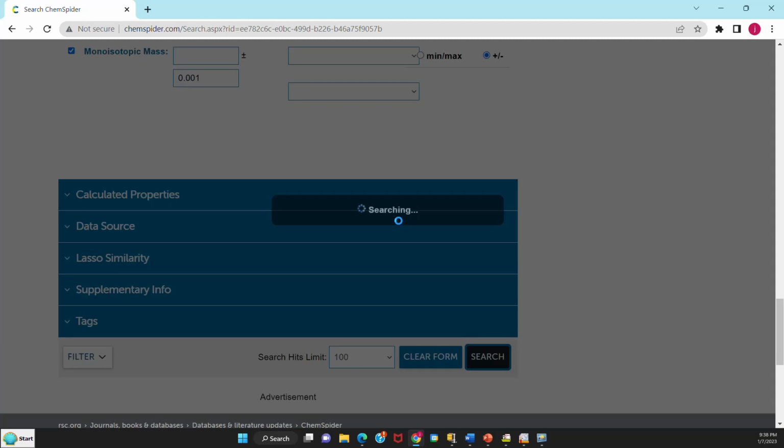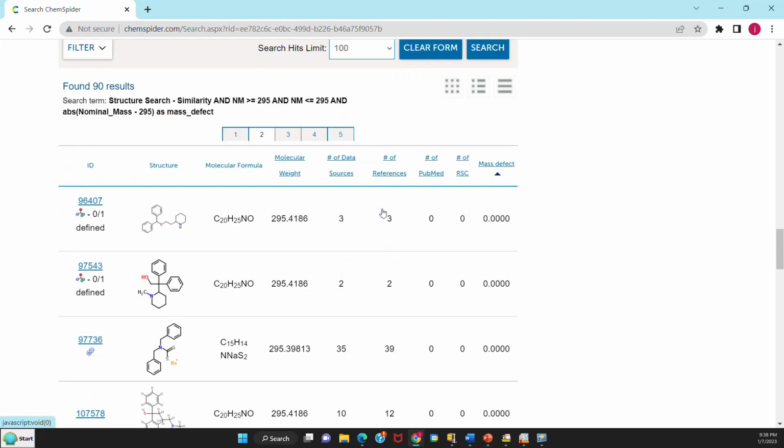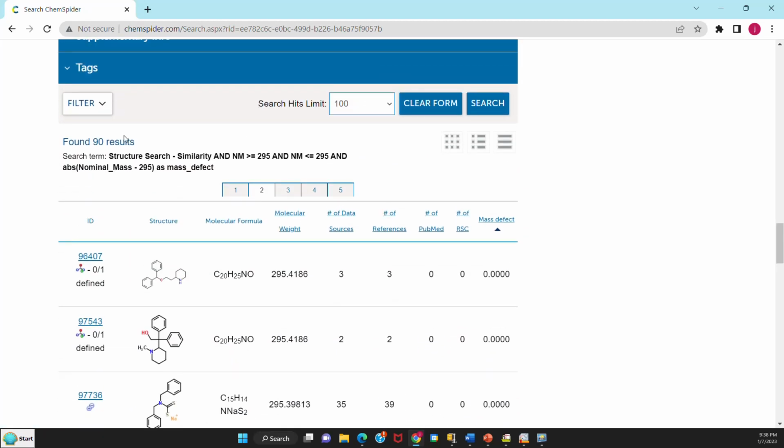And again, this might take a while to do, so I'll wait a few seconds here, but then I'll just exit the active display and bring you back in when the search results are shown. So the search results are done now. Instead of the very few number we had before, we have 90 here to look at over 5 pages.